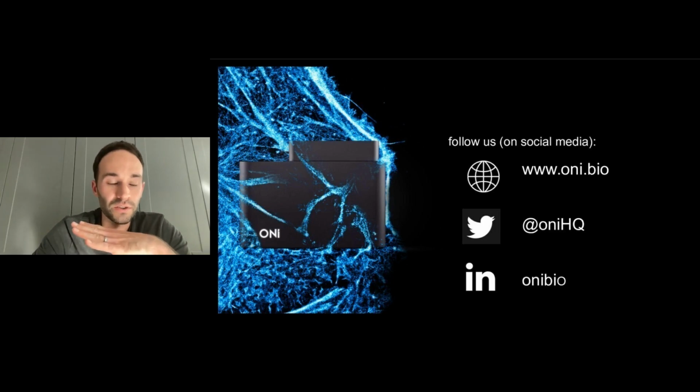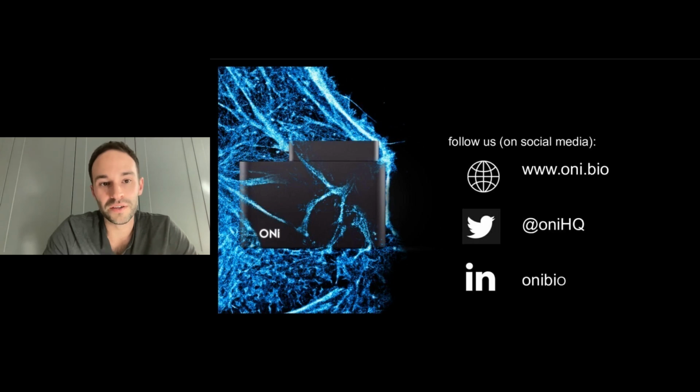All you do is you have your photoactivatable molecules. They are generally all off at the start of your image. You then turn on the UV. You can either do it as pulses or you can have it on continuously at a very, very low laser power, which means that they will stochastically activate. And then you acquire the data with your excitation laser on as well, which would be one of the, like, the red laser or the yellow laser. And then they effectively blink. What's actually happening is they're not blinking, they are getting activated stochastically. However, it amounts to pretty much the same thing, and then all the data analysis is exactly the same. So PALM is completely possible.